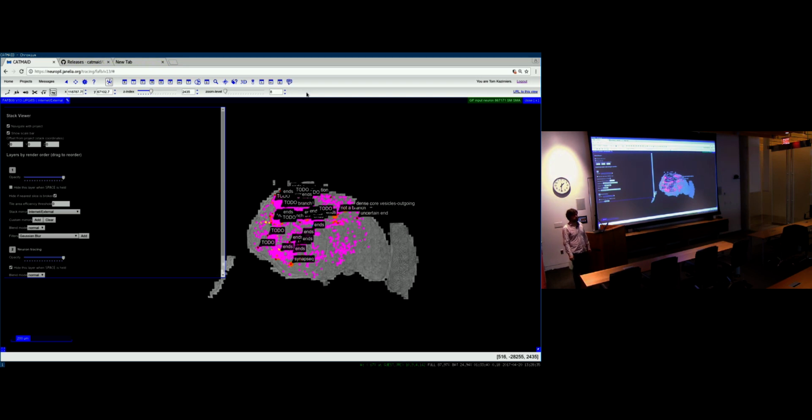Comments, suggestions, bug reports? You know how in the other version you got it so that the tag thing would stay on? Can you do that so you don't have to have the bounding box on as well? Yeah, makes perfect sense. I guess in the end, many widgets would actually benefit from some setting persistency, but especially in the 3D viewer, yeah, I'll make a note and see if I can prioritize this state saving a little bit. At least for the 3D viewer, it should be relatively simple to get this done. Just a second.